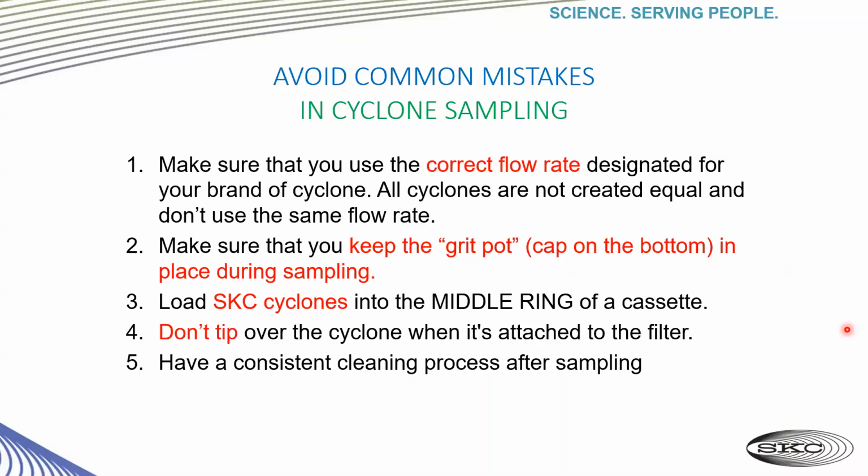And lastly, you must have a very consistent cleaning process after sampling or before using it again.